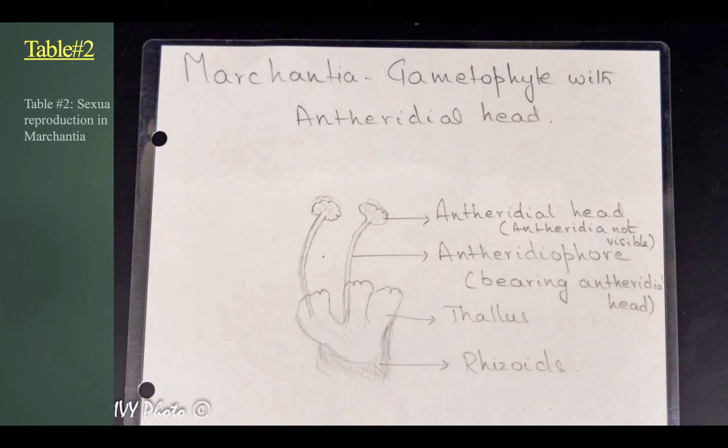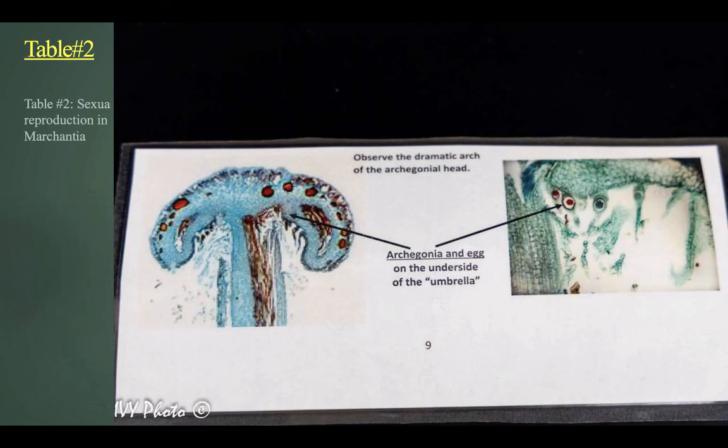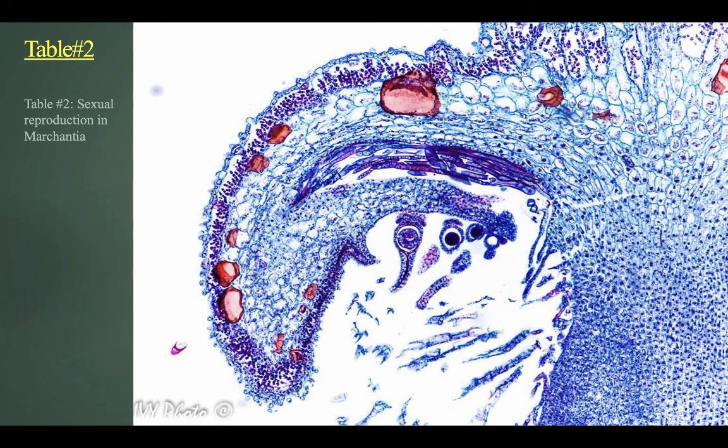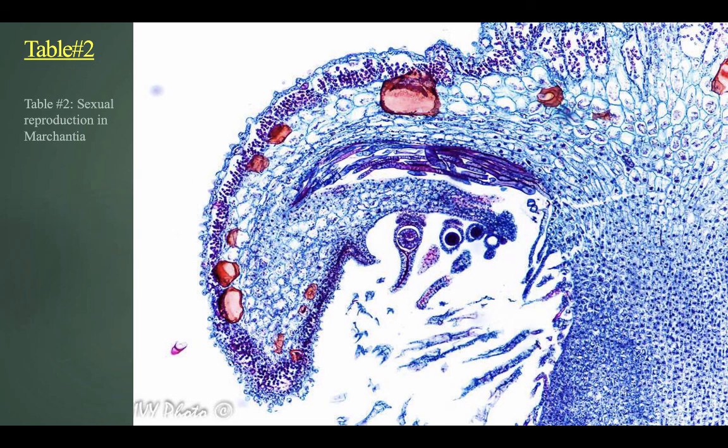And the idea is that one species essentially has to take a lot of energy to make and help generate the gamete or the zygote later, and the other doesn't. So that can help. Now, the next thing that they'll do is they go into all of the different microscopes. So at this point, we're still in sexual reproduction. And if you look here, it's archegonia that it's showing you. So this is just giving you an overall holistic view and a closer view so that you can essentially see the eggs.